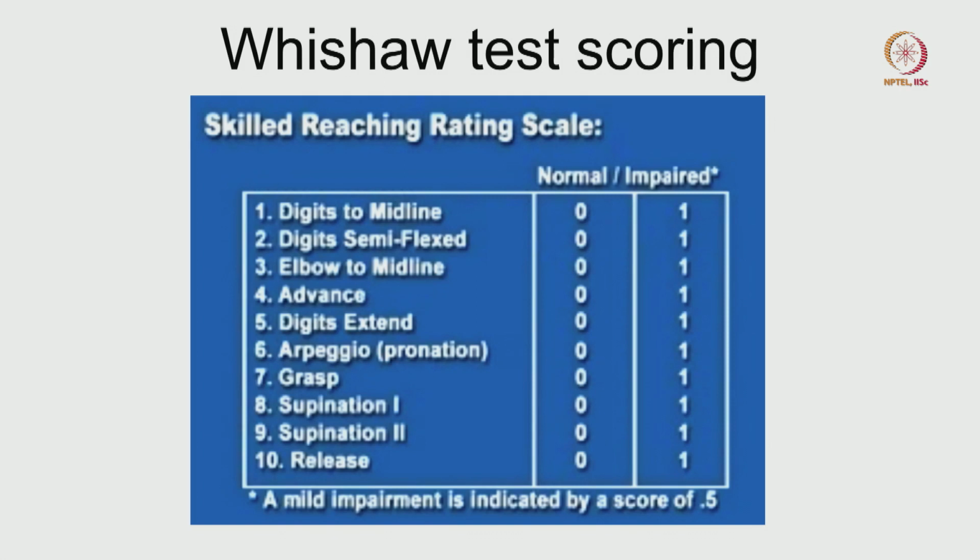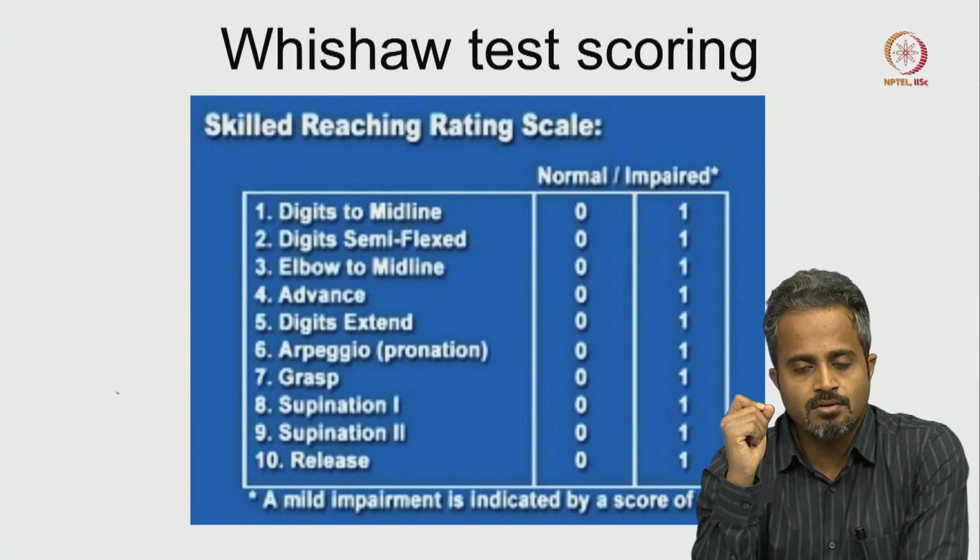All right. So it's very important that you video record it, and how the cameras are arranged around the behavioral setup box has been explained earlier. So this is the importance: capturing these 10 different steps of that single task is of paramount importance.